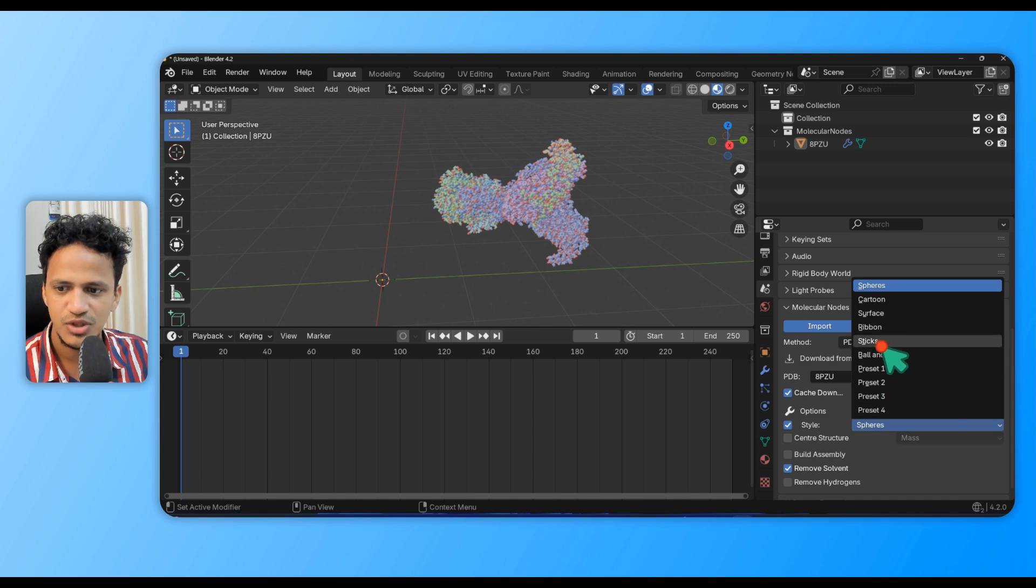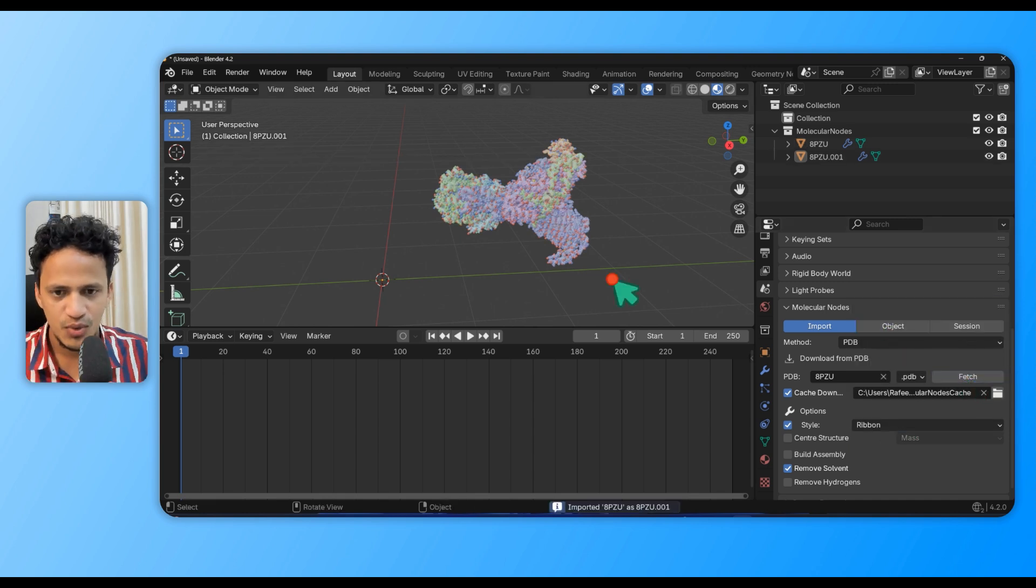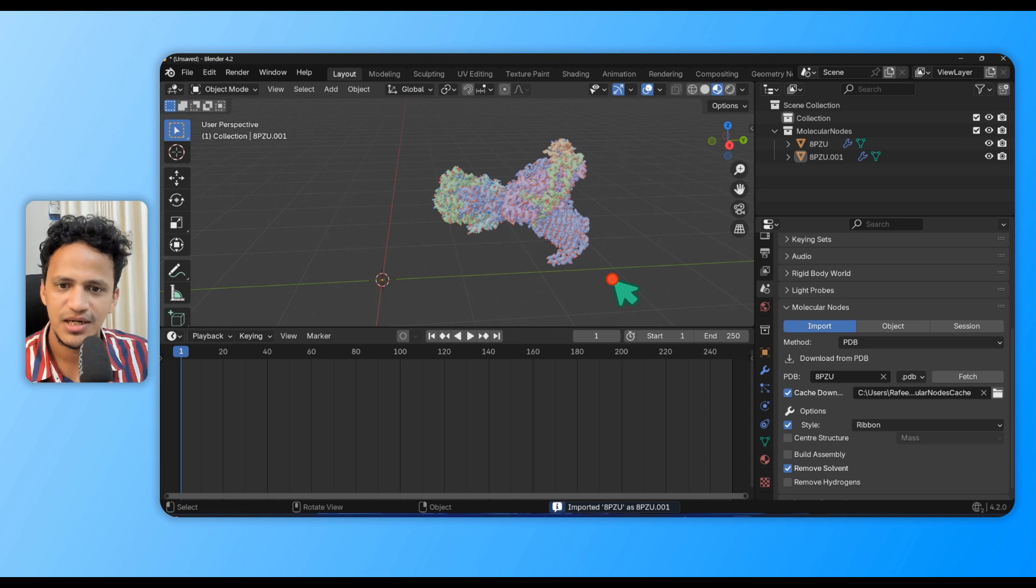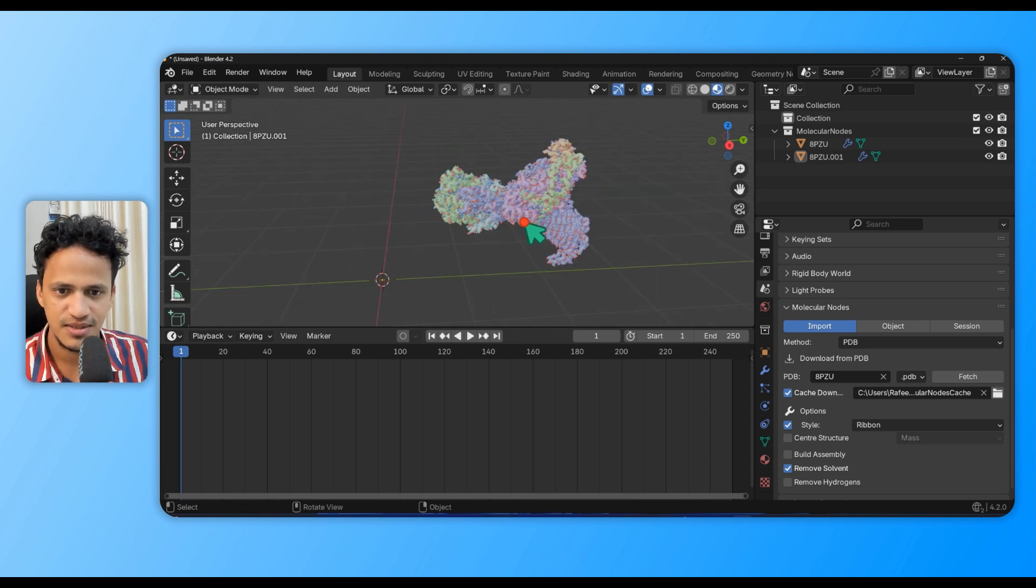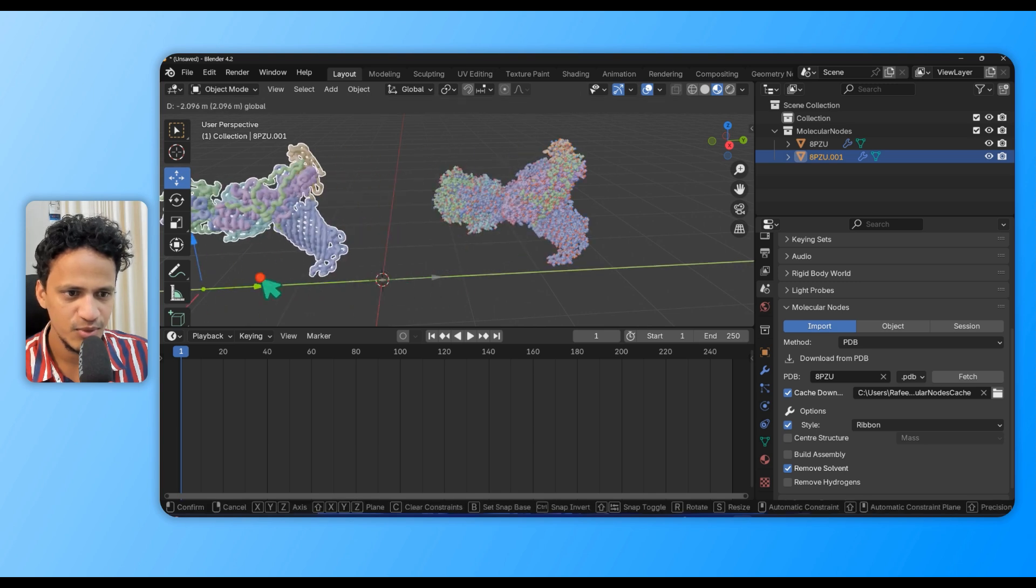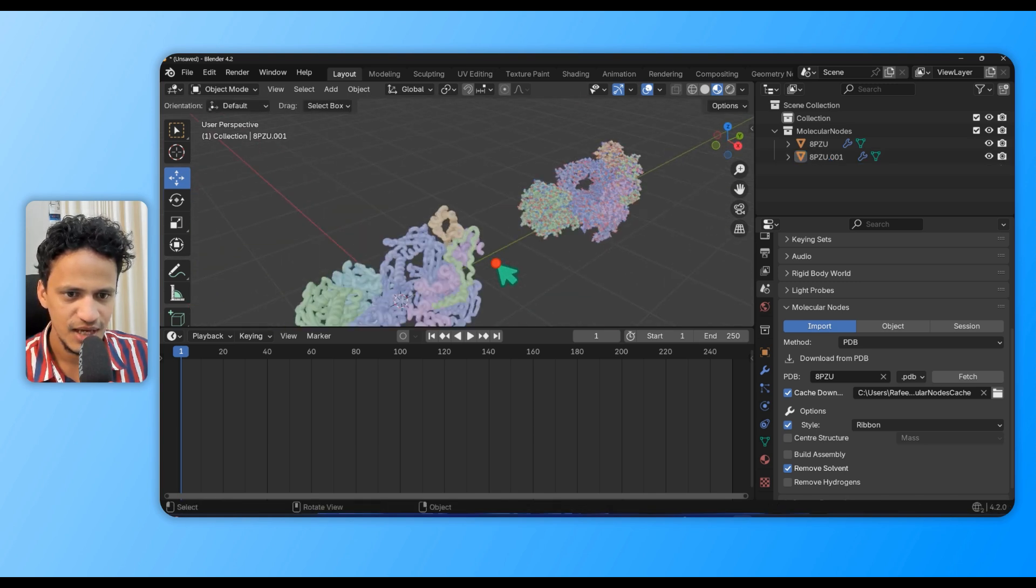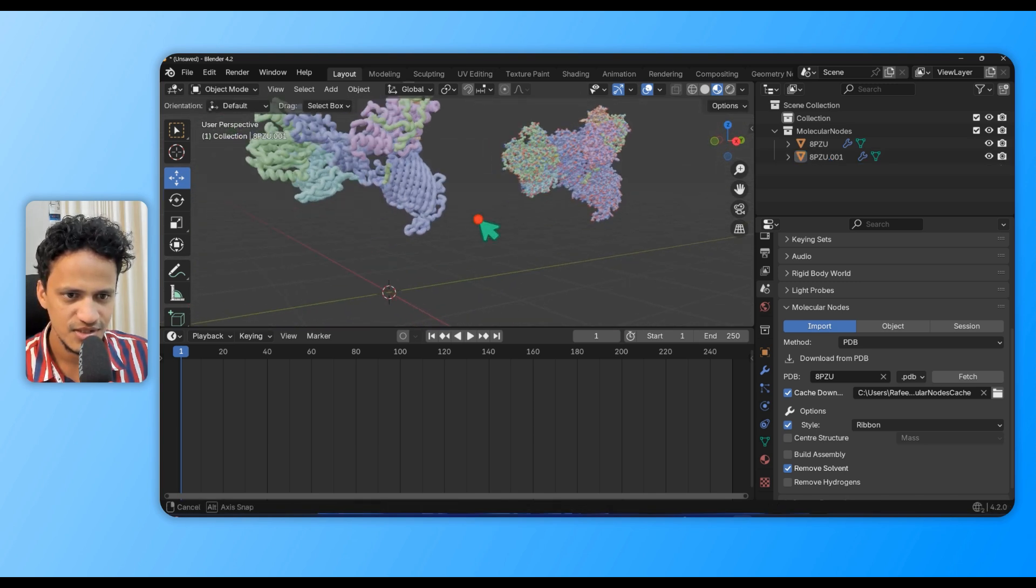Change the style to Ribbon and fetch again. Now it will download the protein in a different representation. It has downloaded already. I'll use this move tool and move it out - see, we have a protein structure in a different format.